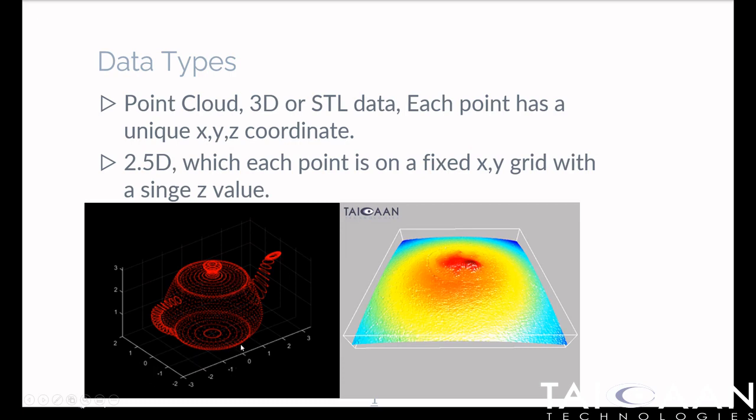In this example, for a given X-Y coordinate, we've got four positional values for Z. That doesn't work within BEX.